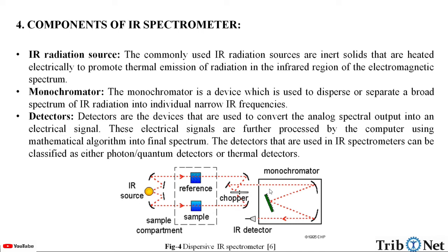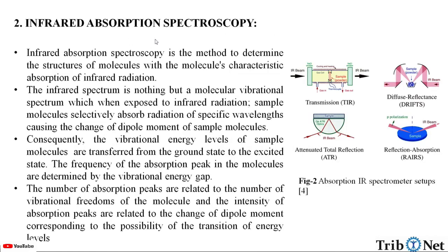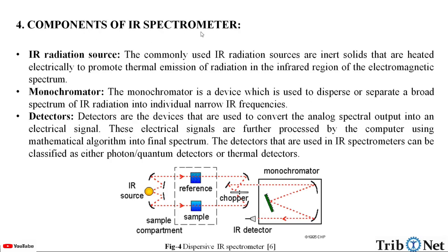In this video, we understood what is infrared spectroscopy, what are the infrared absorption spectroscopy and dispersive spectroscopy, and what are the components which are involved in a spectrometer.